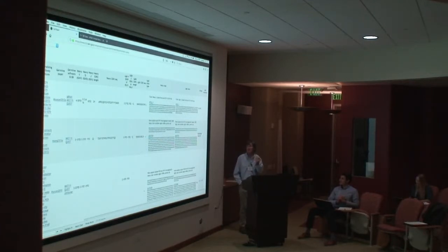I will note just as an aside, this sort of thing makes me very, very sad, because this is the antibody 10E8, which has been interpreted by some software we won't name, Microsoft, to be a numerical value. That is to say, 10 times 10 to the 8th, or 1 billion.